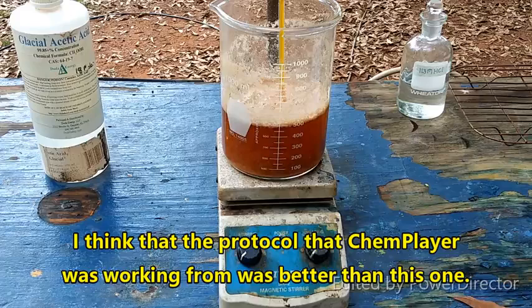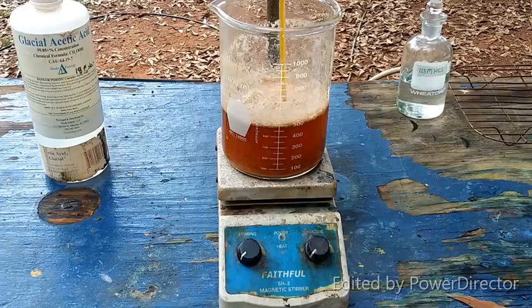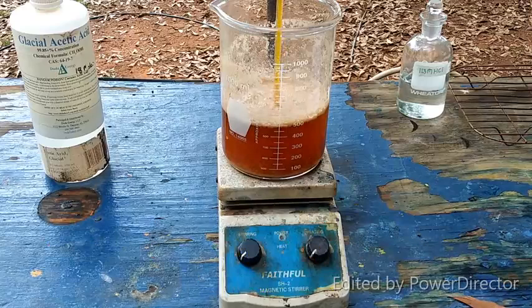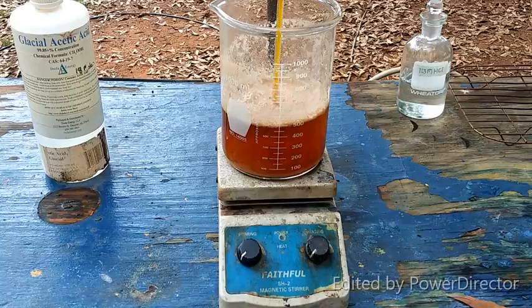I think I probably ended up with maybe about 100 mils too much liquid than I should have. Although, as you may have picked up on by now, so long as I get some anthranilic acid off this method at this point, I'll be happy. When y'all aren't doing this at home, you can have fun optimizing this pain in the ass.